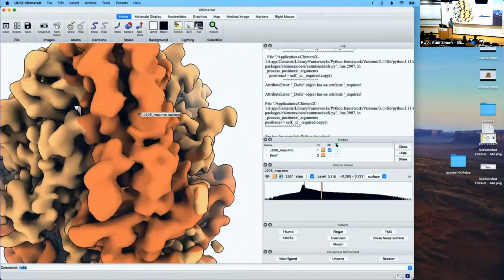If you remember during the fundamentals, when we were talking about the GSFSC resolution, this map is actually sub 3 angstroms GSFSC resolution. And this is why I really wanted to emphasize that the global GSFSC is just one number, right? On average, in total, this is a very high resolution map. But one of the parts we care the most about, which is the thumb, we want to really learn how this thumb associates with the ligand and moves, is actually poor resolution. Well, not very poor, but much poorer than 2.8, right?